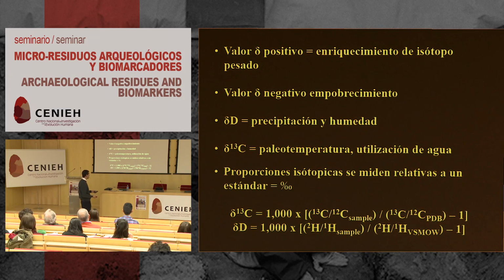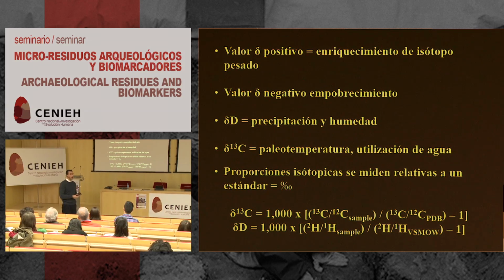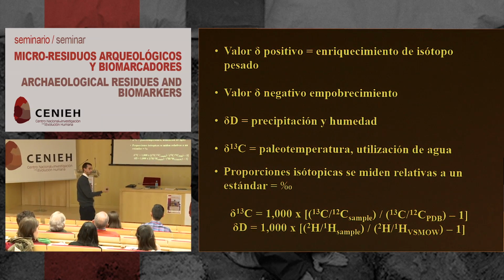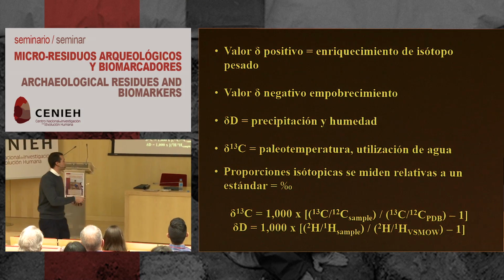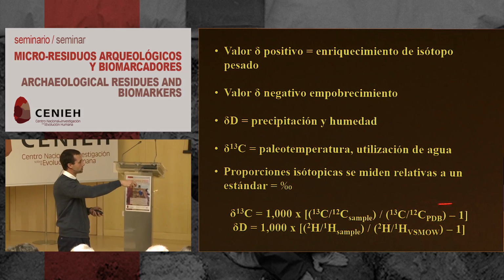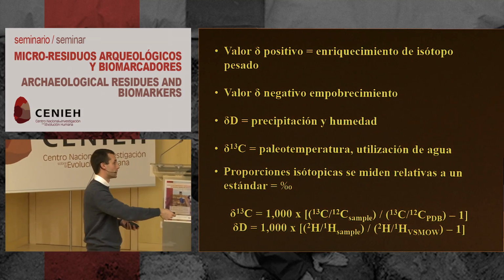Okay, so once we have our compound abundance, it's a really simple setup for analyzing the N-alkanes. We then really need to know what isotopes are comprising those individual compounds. We read these a few different ways. So again, like I said earlier, this symbol here means delta, which is a ratio. And here's the formula for the ratio between the heavy element and the lighter element.